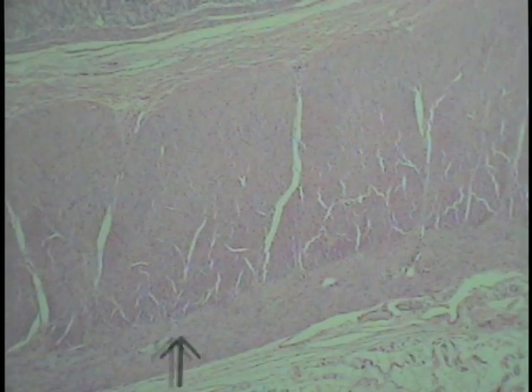So the epithelium, the lamina propria, and this muscularis mucosae, as elsewhere in the gastrointestinal tube, constitute the mucous membrane of this particular region. Also shown here quite well is the boundary and the limits of the underlying submucosa. And then we get into the huge muscle wall of the stomach, the muscularis externa, which in this particular region consists primarily of a very thick circular layer and a relatively thin longitudinal layer of smooth muscle forming this muscularis externa. So this is the muscle wall, consisting of an inner circular and an outer longitudinal layer.